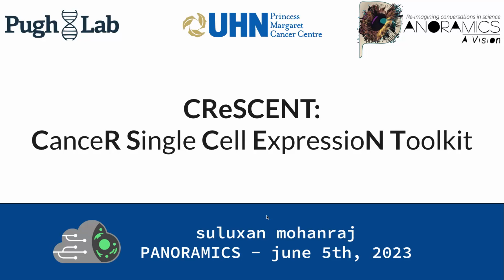So the idea around Crescent is to streamline all of that, turning these very specific workflows and pipelines into a series of buttons in a web app.